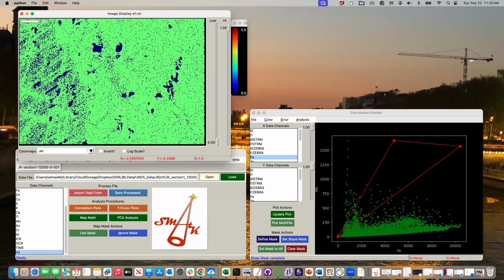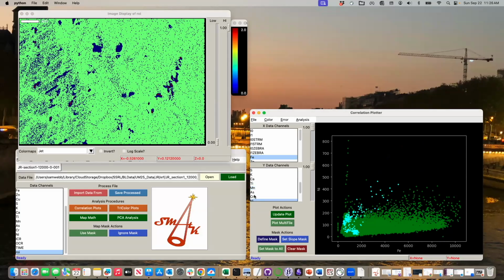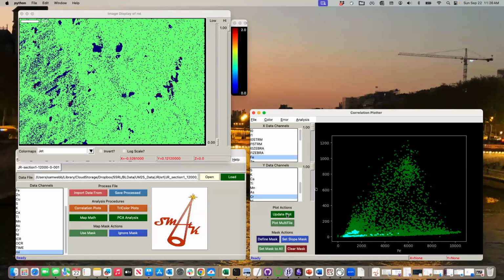And now I could even take this and go back to my favorite particles over here. Chrome, right? I can do a manual mask just for fun and call that this, right?